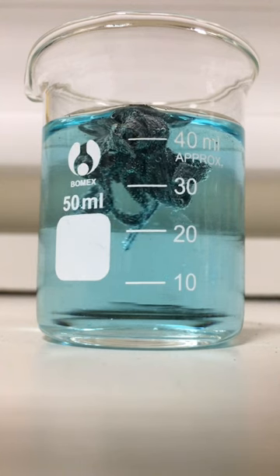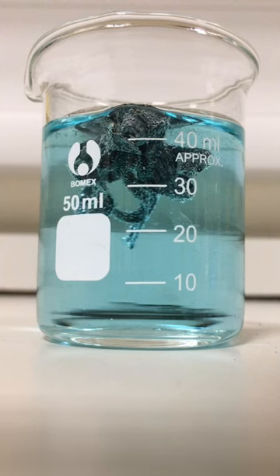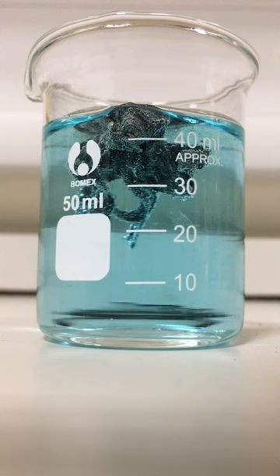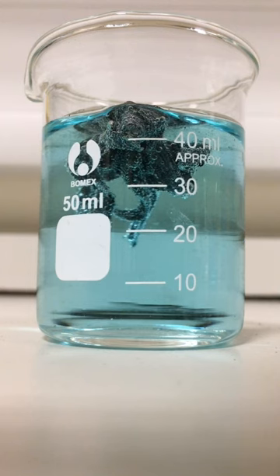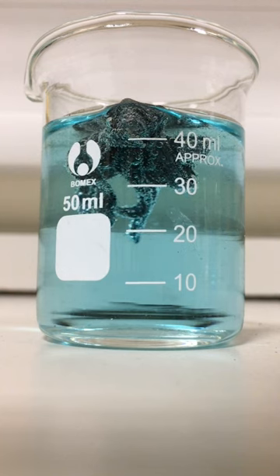You can see quite nicely on this camera that we're getting bubbles forming. The bubbles formed are a result of magnesium reacting with the water, making the magnesium hydroxide and hydrogen. The magnesium is quite light, it's low density, so it's floating, almost floating, certainly at the top of the beaker.